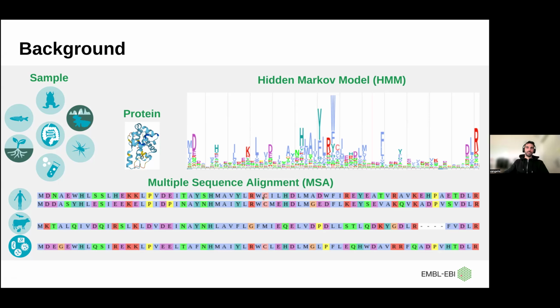But if we have, let's say, very random sequences put together, the generated HMM will be very sensitive, so it will be recruiting garbage into our families. On the other hand, if all our proteins are very, very strictly homologous, very similar to each other, this will make the HMM very specific. So it will only recruit certain orthologs in the family.